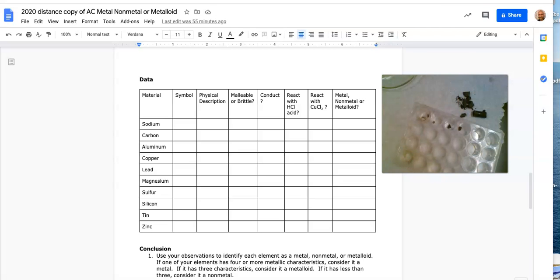Let's see about copper chloride. Funny thing just happened. I noticed that other bottle I had before wasn't copper chloride, it was calcium chloride. But I think it would have reacted the same with the sodium, but I was wondering why it wasn't blue like I expected. It's kind of this blue color is what copper is.